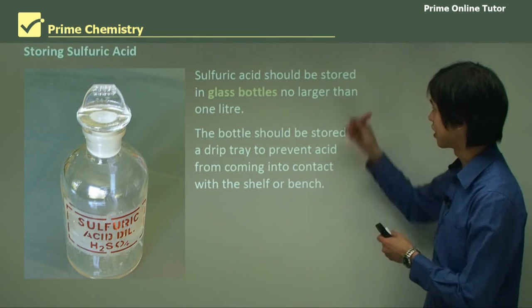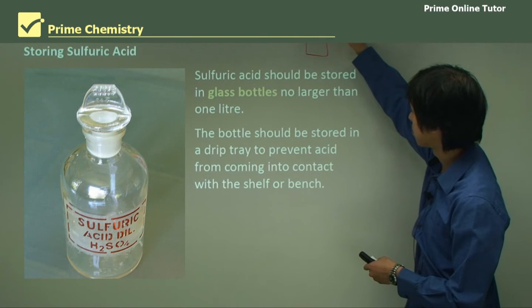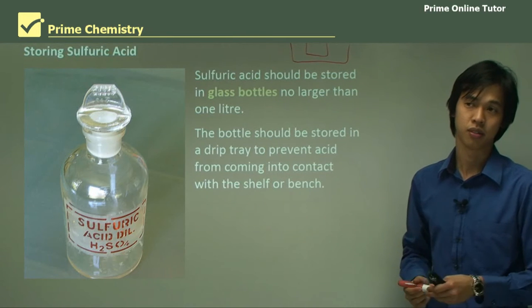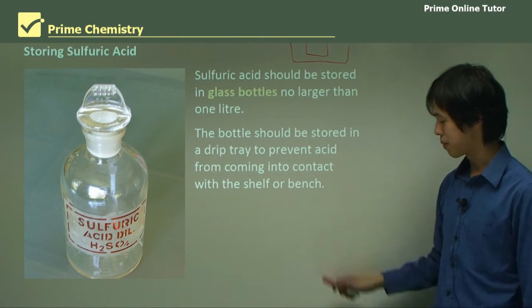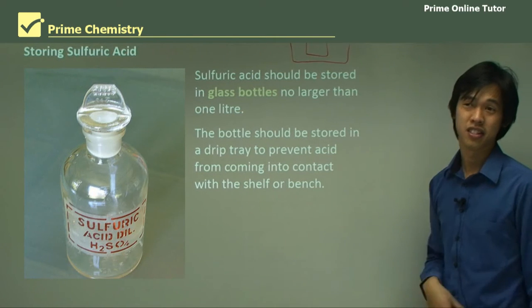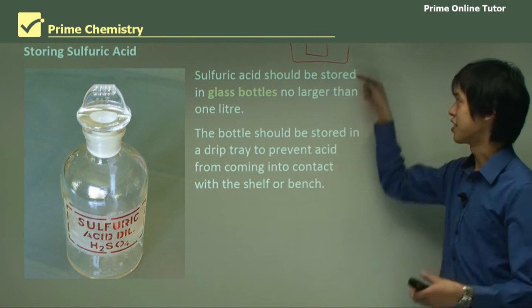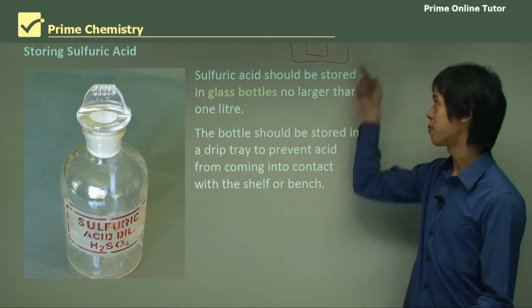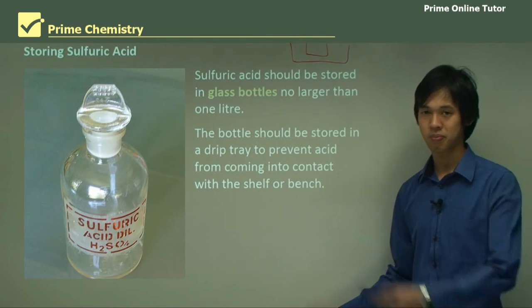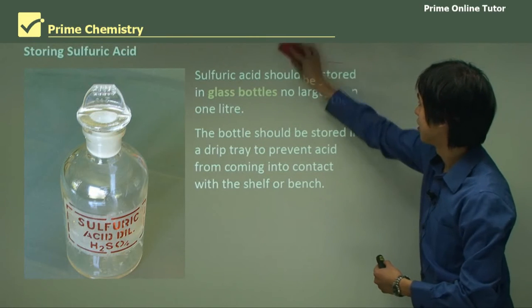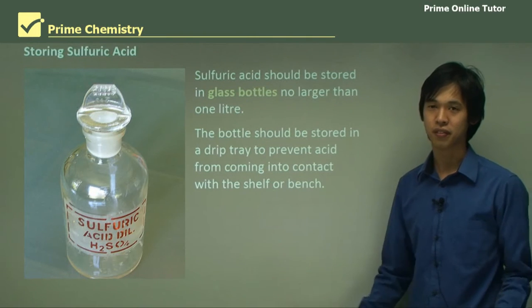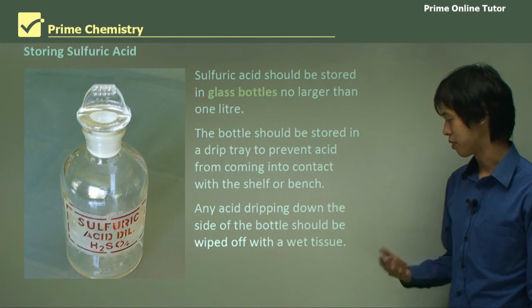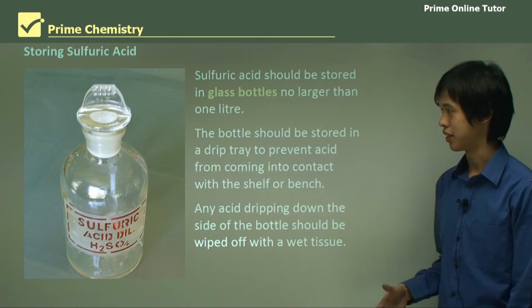A drip tray is essentially a secondary tray placed underneath the bottle to catch the acid if it happens to spill or someone knocks it over. It should be big enough to contain all of that liquid safely — so if the bottle holds one litre, the tray should hold at least that volume, preferably bigger if space allows. Any acid dripping down the side of the bottle should also be wiped off with a wet tissue straight away.